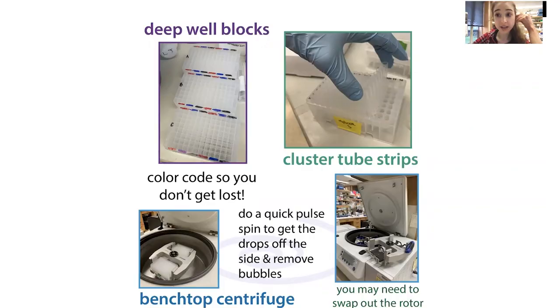In addition to tubes, we have blocks. Deep well blocks are really handy — when purifying proteins, we can collect fractions in one of these. We also have cluster tube strips — strips of eight tubes, kind of like PCR tubes but bigger. These are handy when you have a lot of samples and want to use a multi-channel pipette but then need to take individual tubes out for further steps. The bad thing about using a block is it can be really hard to tell wells apart, so I like to color code things so I don't get lost.